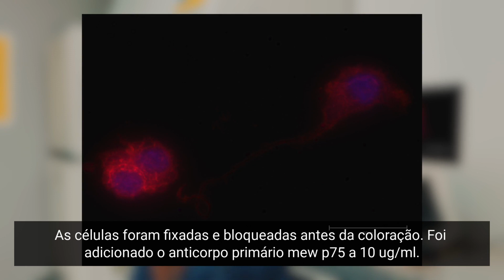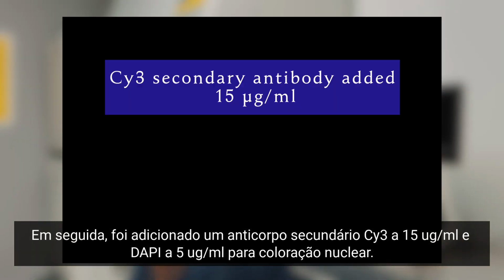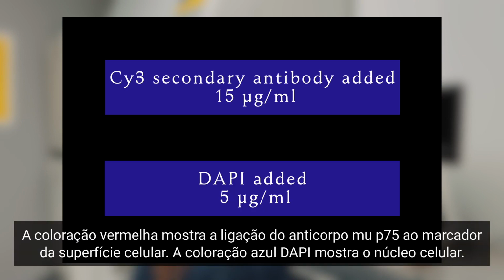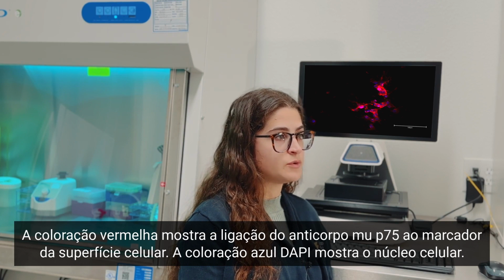The cells were fixed and blocked prior to staining. The primary P75 antibody was added at 10 microgram per milliliter. Then, a Cy3 secondary antibody was added at 15 microgram per milliliter and DAPI at 5 microgram per milliliter for nuclear staining. The red staining shows the binding of the P75 antibody to the cell surface marker, and the blue DAPI staining shows the nucleus of the cell.